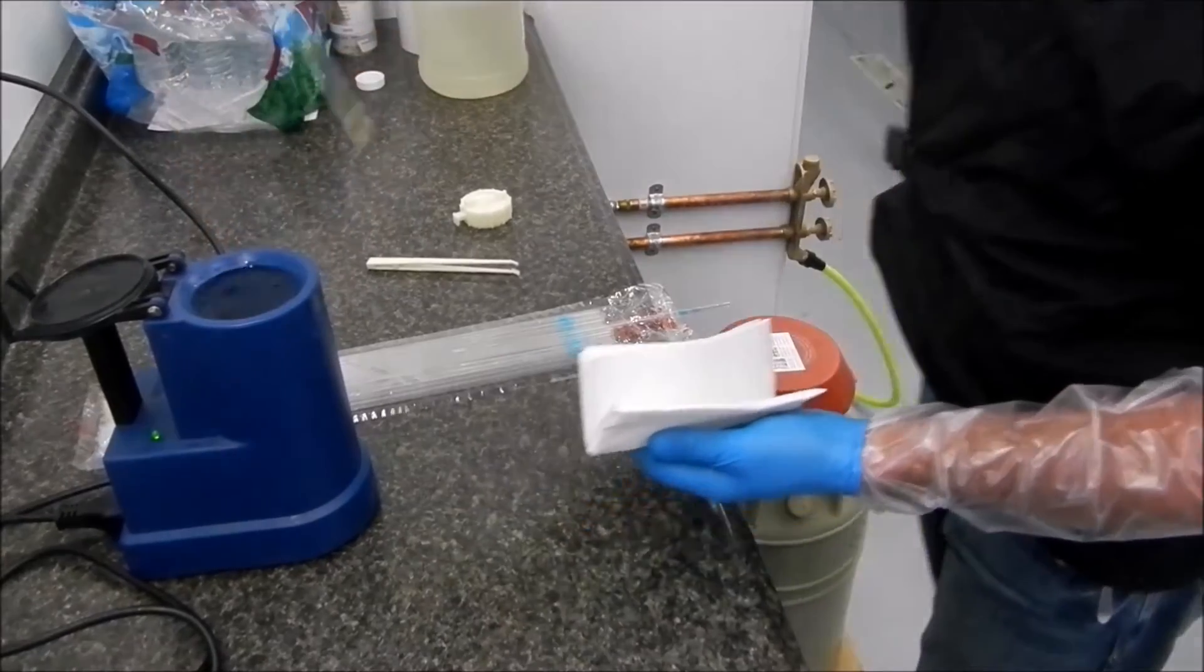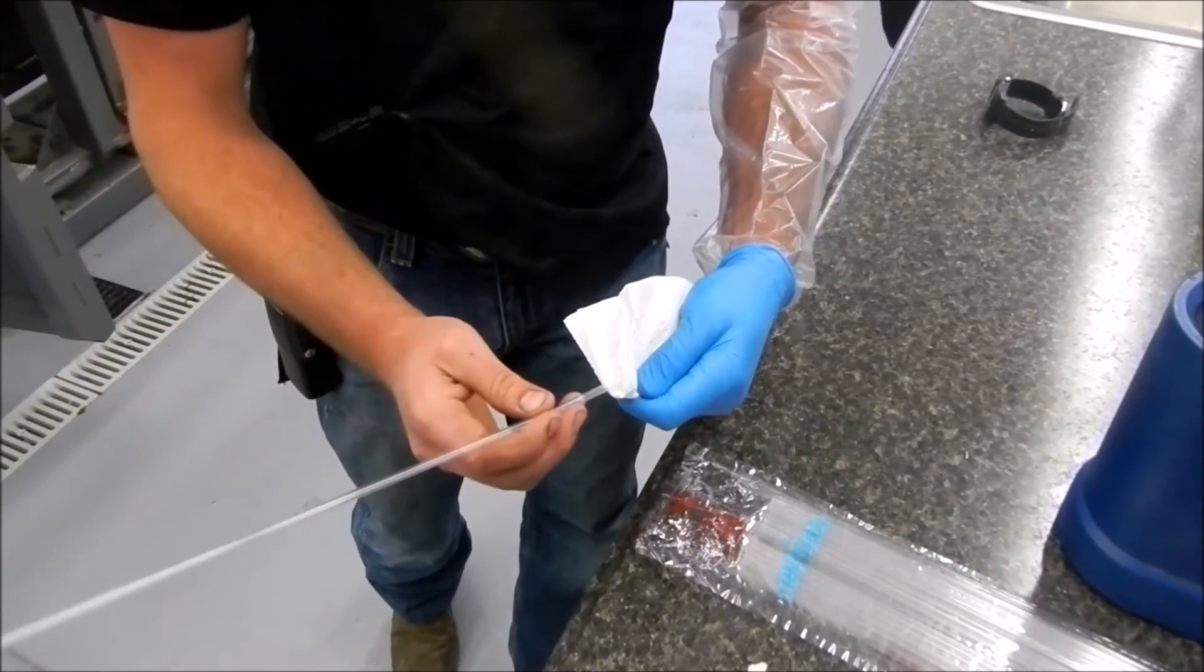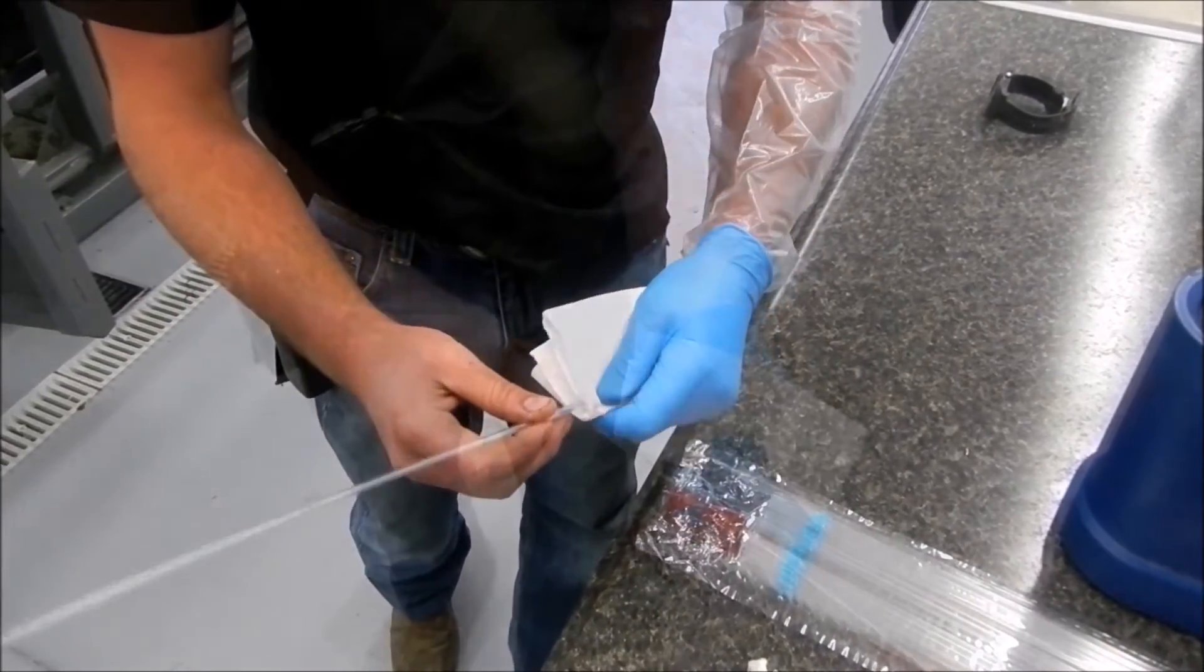We then remove the semen from the water bath where we dry it off with a paper towel, insert it into the insemination gun, and move quickly to the cow.